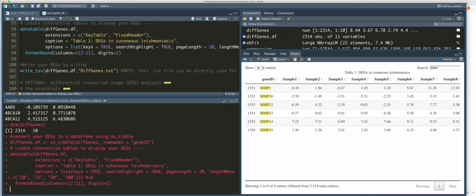Now that you're done with differential gene expression analysis, we would normally stop the step 5 script at this point, but I really wanted to add something. I try to add something new to each iteration of the course, and there's been some exciting developments since the advent of these pseudo-alignment tools like Kallisto and Salmon to be able to look at that transcript level data in more detail and to use it to carry out additional kinds of analyses beyond DGE analysis.